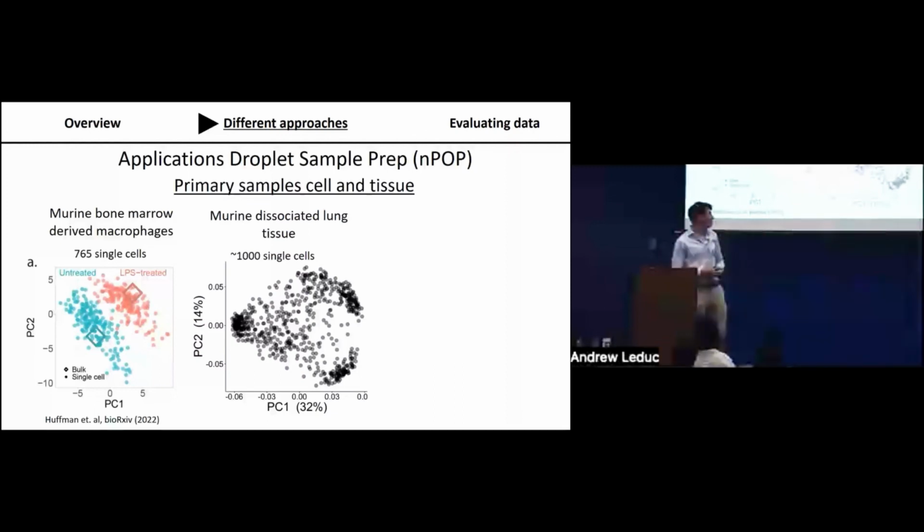And we've done tons of studies where the first cell is dispensed almost an hour before the last cell, and we don't see substantial differences in the proteome over time, at least on these time scales. Again, I haven't looked super deep into this, but to the extent that we've examined it in our data, proteomics is nice in the sense that we don't see so many substantial effects along these lines. But of course, if you're interested in a specific biological question, I suppose it's on a per case basis sometimes.